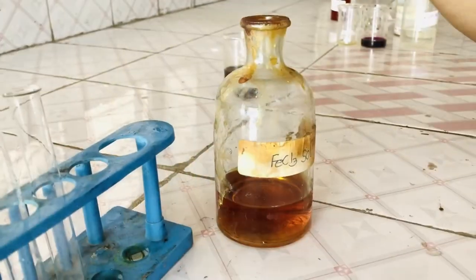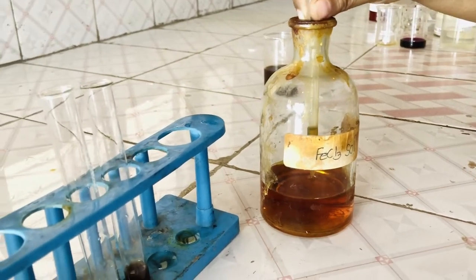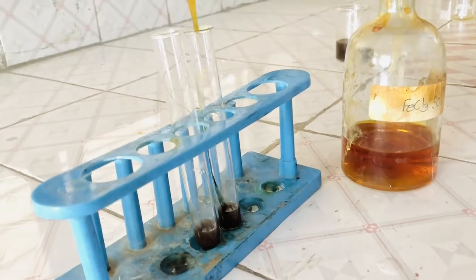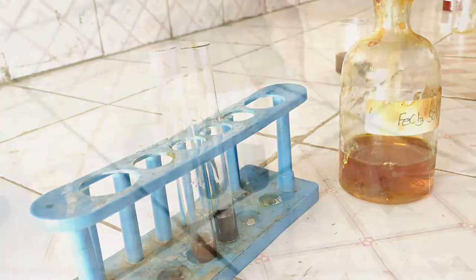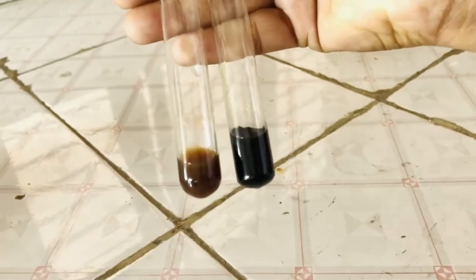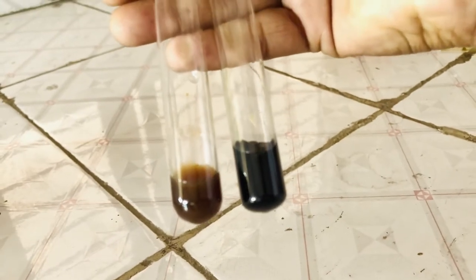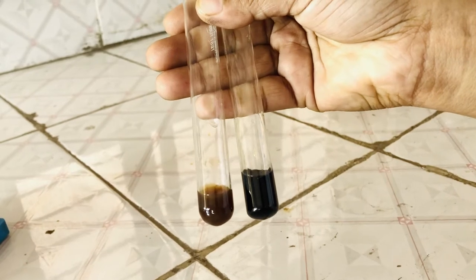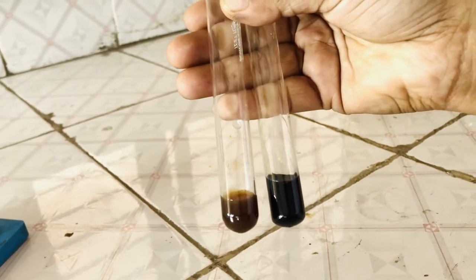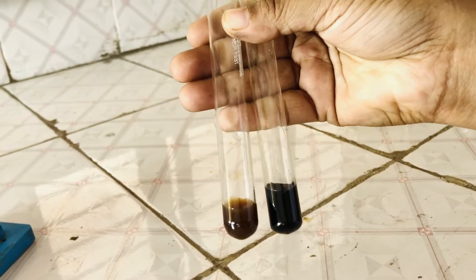Now we will add 5% FeCl3 solution in the test solution. You can see the blue-black color has appeared in the test solution as compared with the standard solution. This confirms that the FeCl3 test is positive and we have obtained amla as a hydrolyzable tannin.